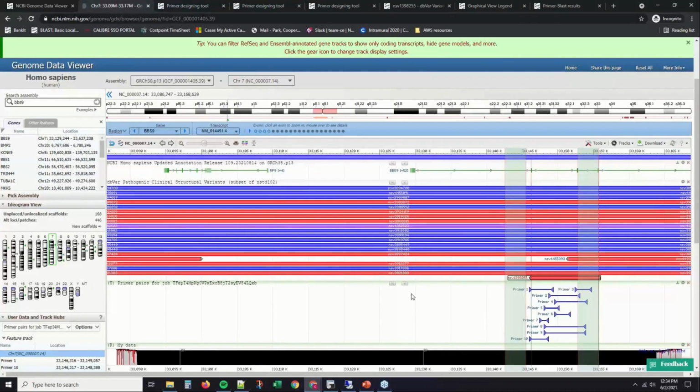I keep forgetting about that too. We have so many little things in here, and so you reminded me to check, and I was like, I think that works. Okay, well, I don't see any other questions. Someone did ask about how to format a BLAST database, and Wayne answered that one, which isn't directly relevant to this particular webinar, but you can find out more about that on our help documents for BLAST.